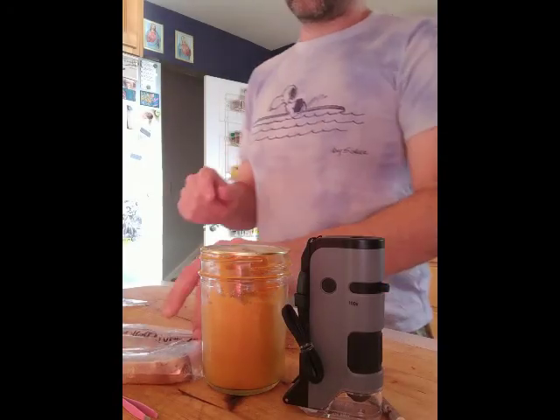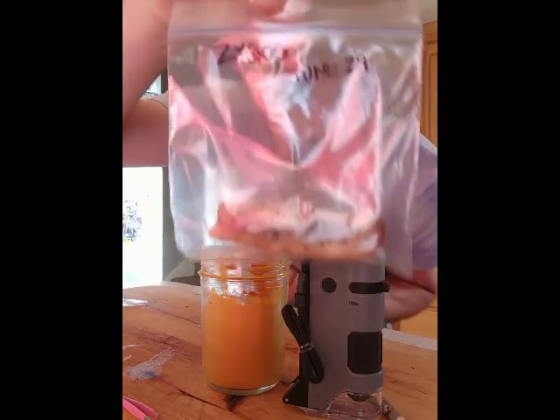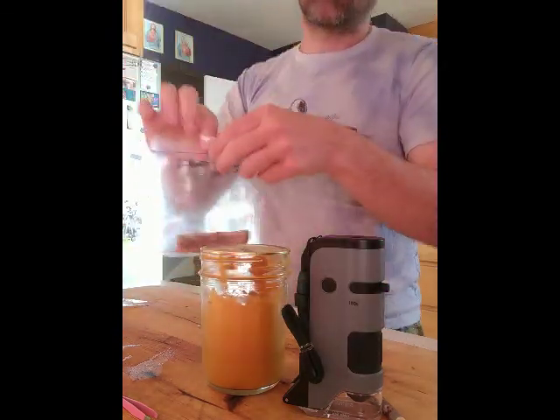All right, let's visualize our Zygomycete — our moldy bread. We got our moldy bread there. It's been going about a week.